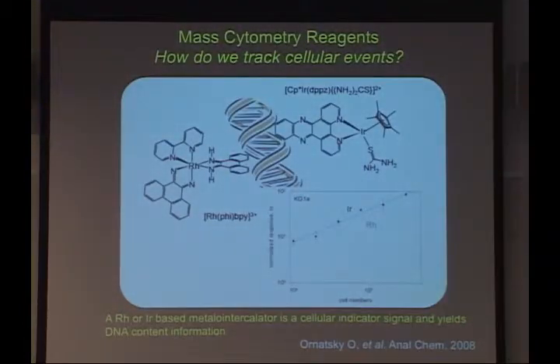Other reagents we have at our disposal. So other than the mass isotope reporters, there's also a DNA intercalator. And this is important. This intercalator is a really handy reagent because the machine doesn't have any light scattering properties. And like I said, we remove all of the biological elements.